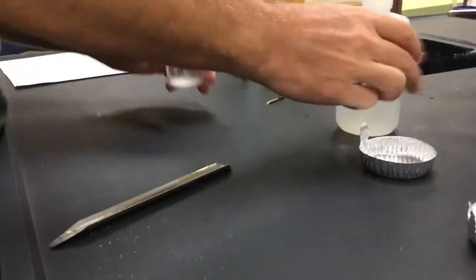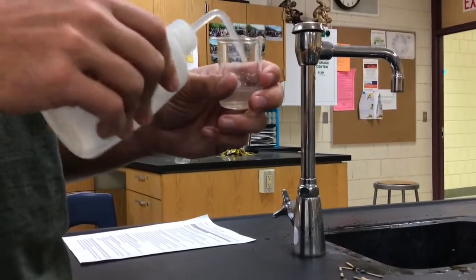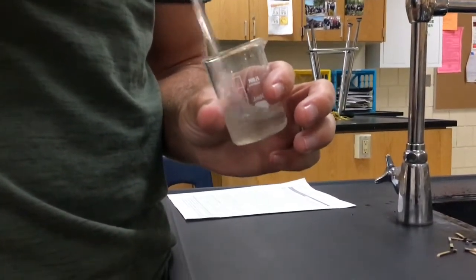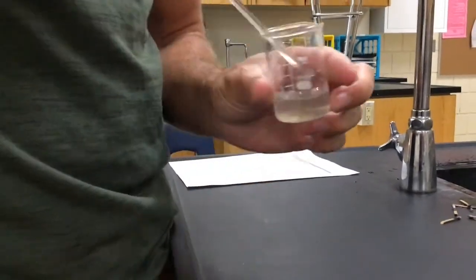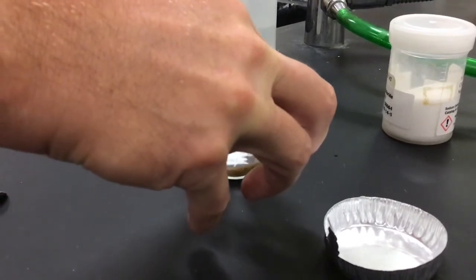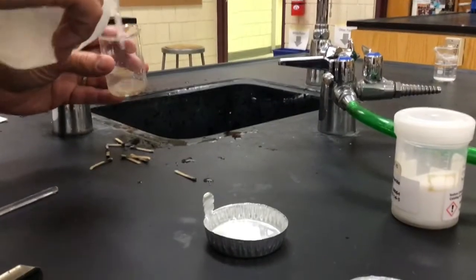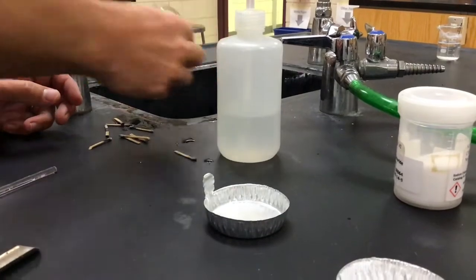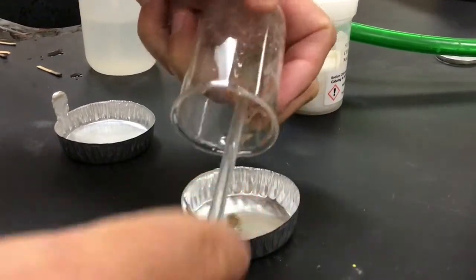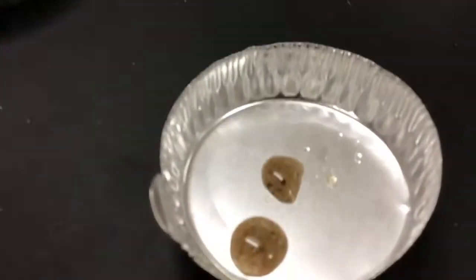Then I'm going to add some distilled water — distilled water is just purified water. I'm going to grab my glass stirring rod and stir it up real nice. Then we're going to decant the liquid — pour off the liquid into this aluminum evaporating dish. I'm going to rinse it out one more time, pour off the liquid again, and then dump the sand back in as best I can.